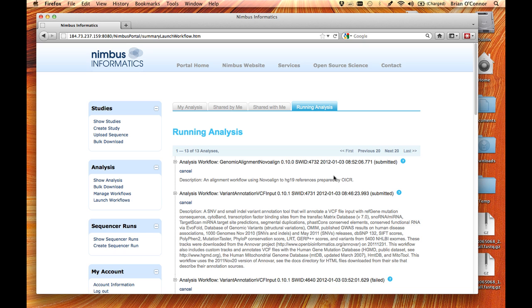If you have any questions, please email help@nimbusinformatics.com. But at this point, we'll just let those run. And in a future video, we'll go into more details about how to string together these multiple workflows and how to pull back results.